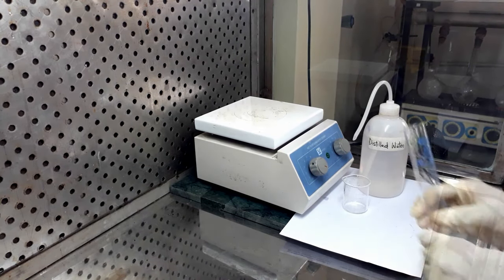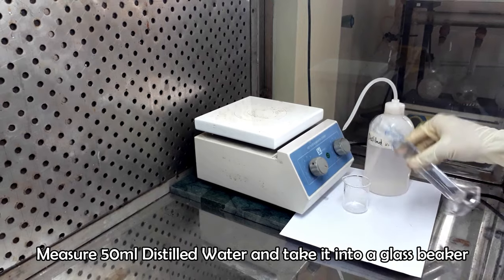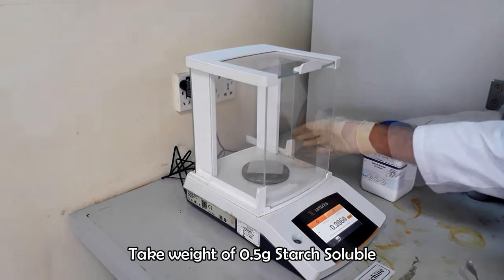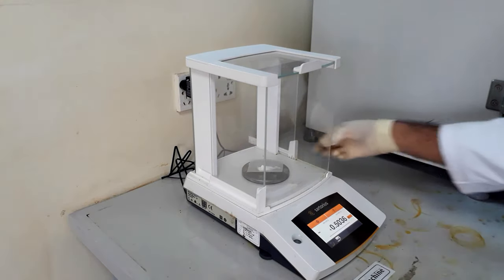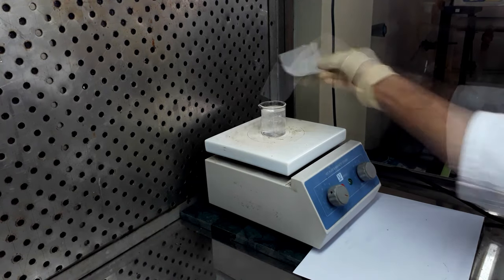For the preparation of 1% starch solution, measure 50 ml of distilled water and take it in a 100 ml beaker. Place the beaker on a hot plate and heat the water to boil. Take weight of 0.5 g of starch soluble and transfer into the boiling water.